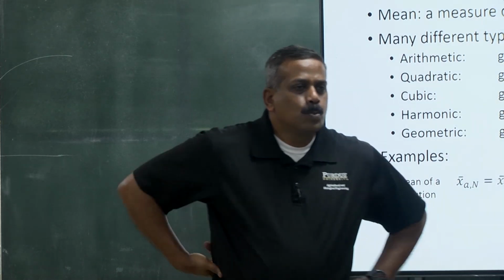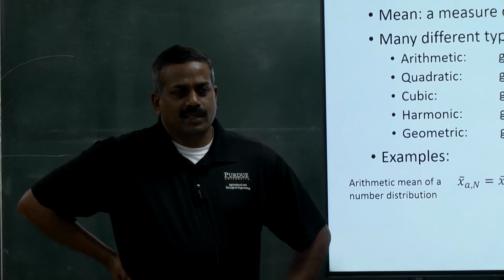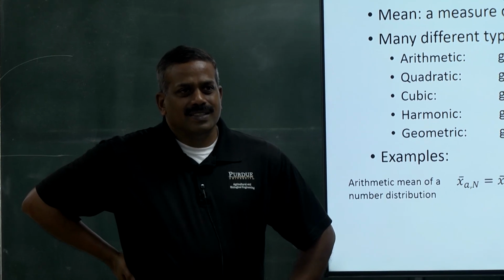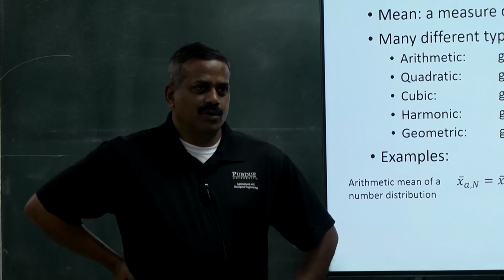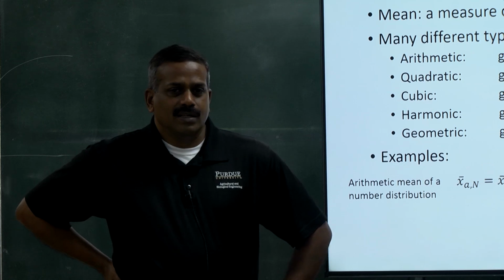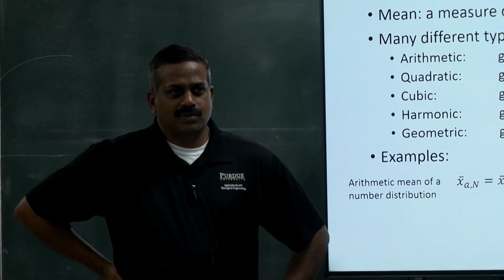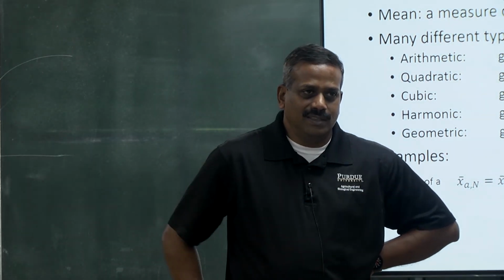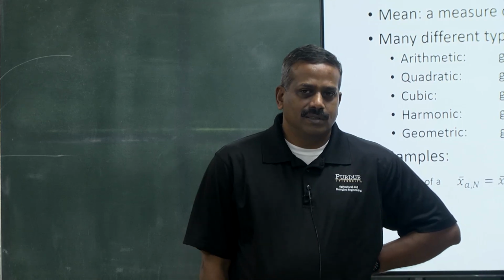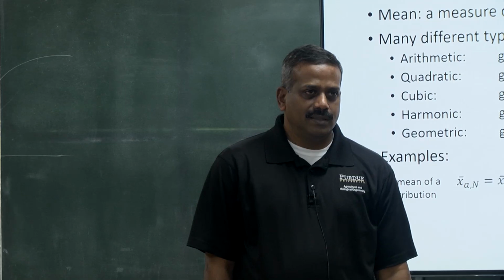Sir, I have heard something like flowability index. Oh yeah, flow index. How to get some insight on that? We'll talk about that in the powder flow lecture. It's more than flow index. It's called flow function. In one of the slides yesterday, I would have mentioned flow function. That's the parameter that we measure using a shear tester. Okay.